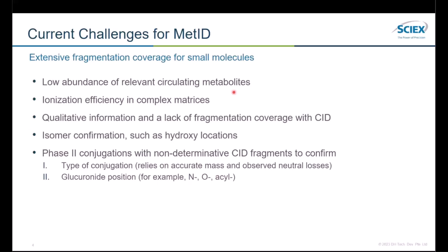But now with the UPLC, since we can have shorter run times and sharper peaks, and then separate those interferences so that we don't see matrix effects as much as possible. But at the same time, we need mass specs that have a high acquisition speed, so that you get low cycle times and still get enough data points across the peak if you have to use that data for quantitation purposes.